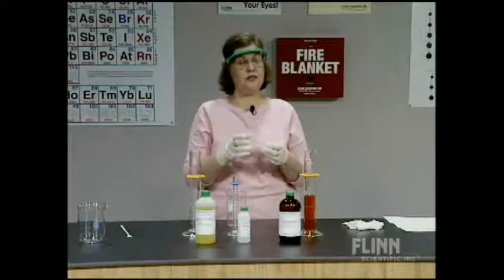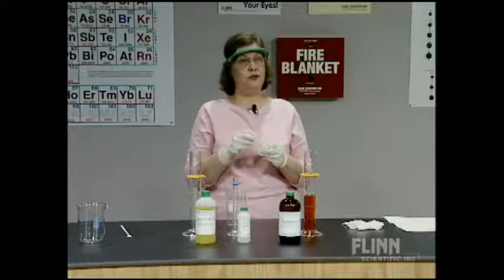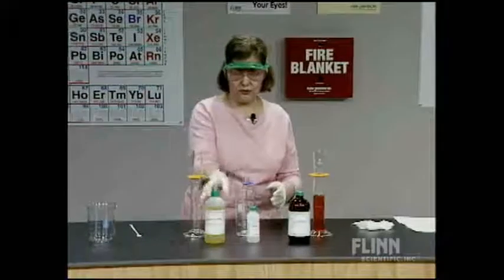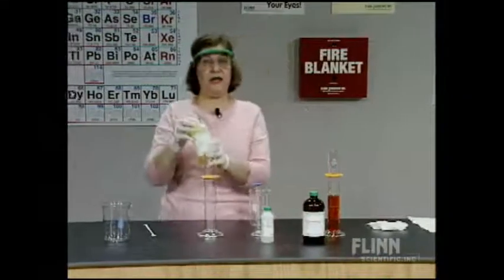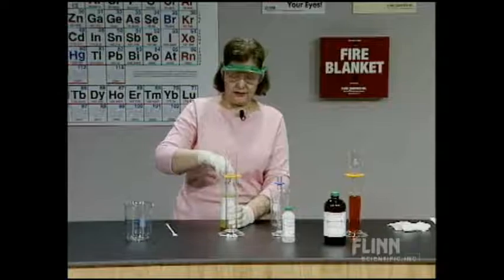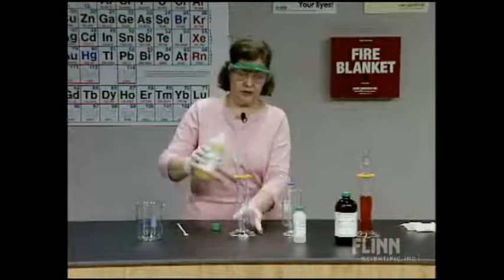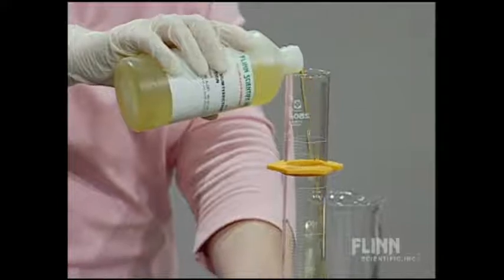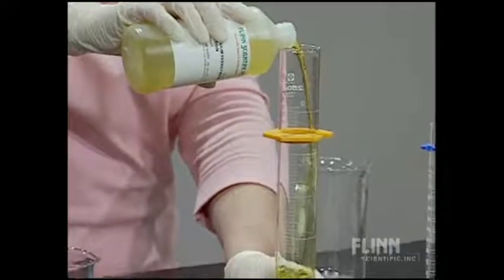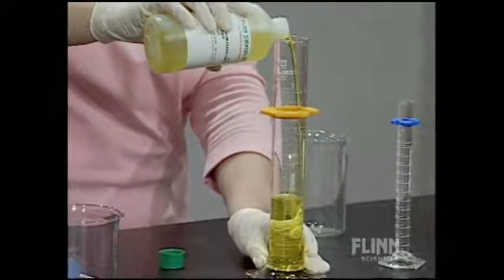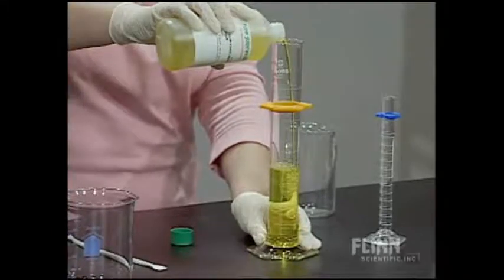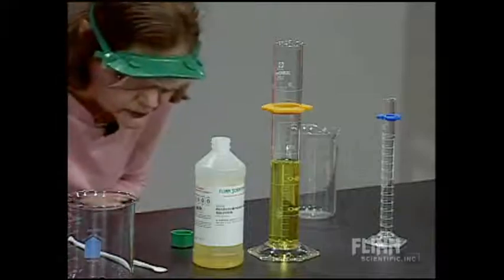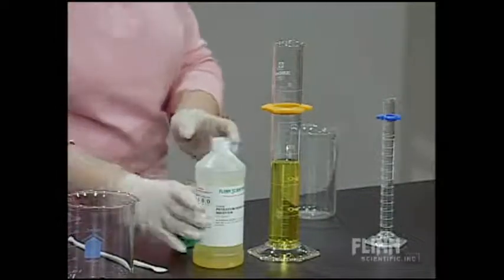The fluorescein and the calcein are both fluorescent dyes, and what they're going to do is absorb some of the light energy initially produced by the luminol. The other solution I have is potassium ferricyanide, which is going to be the catalyst in this reaction. I need about 140 milliliters of that — it's a yellow solution, which is just the color of the ferricyanide ion.